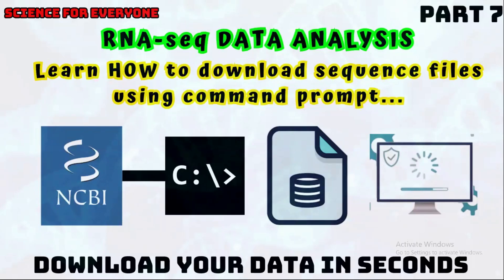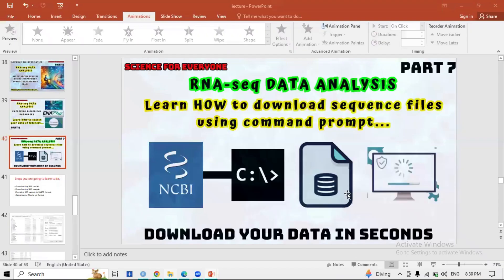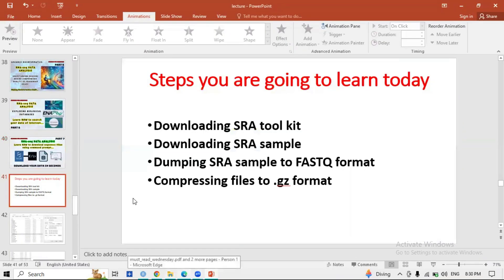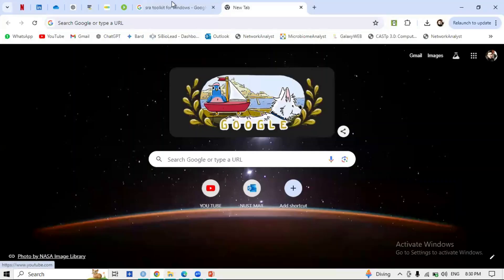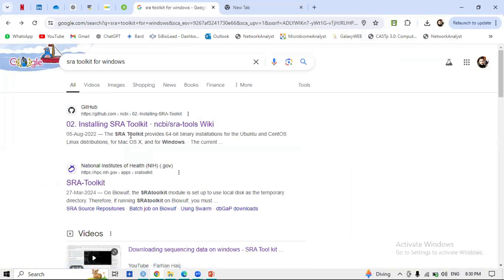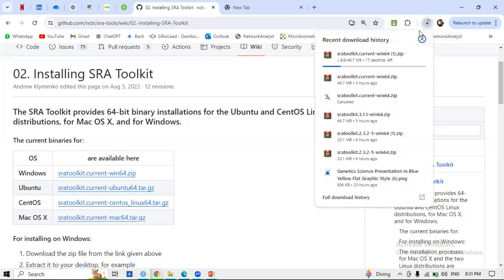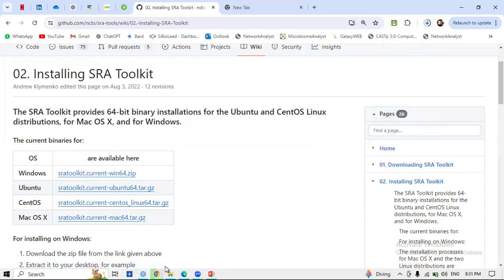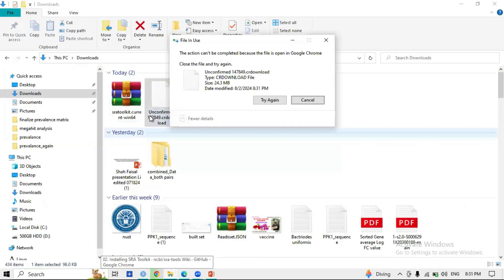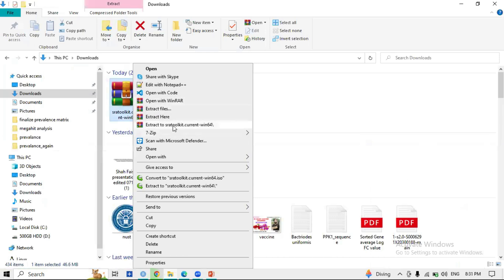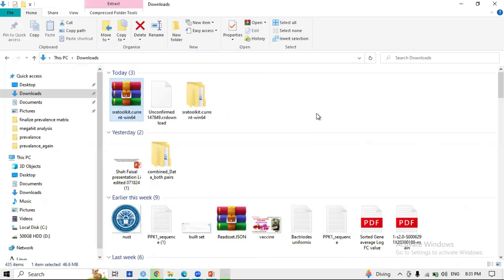Now let's start downloading our RNA-seq files. For the first step — downloading SRA Toolkit — go to Google and type 'SRA Toolkit for Windows.' There will be a link 'Installing SRA Toolkit'; click on that link and go to the Windows option, because we are using Windows and will use Command Prompt. Click on it and the SRA Toolkit will be downloaded. I have already downloaded it. Go to your downloads folder, then unzip or extract it by clicking Extract.